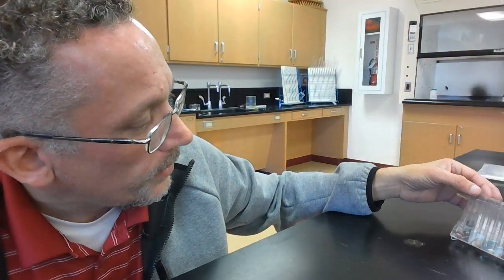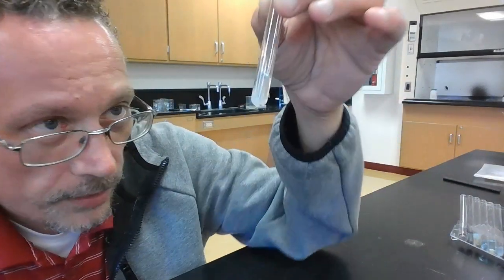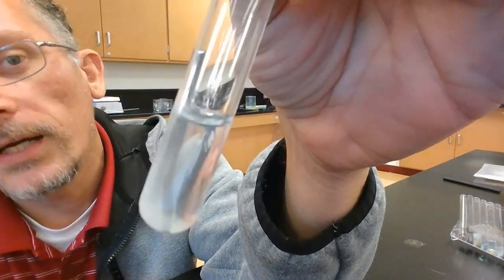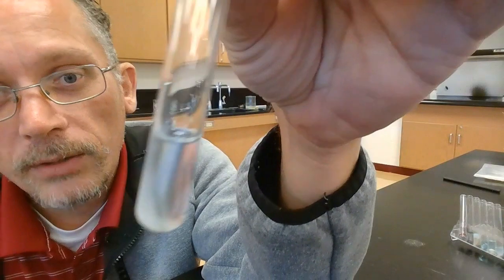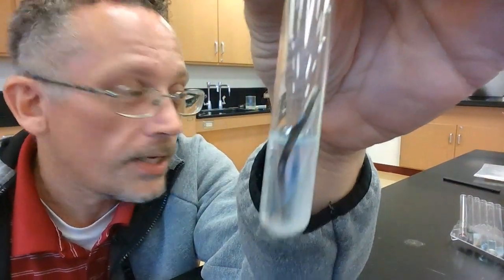And let's see, still nothing has happened with the carbon. Here we can see on the iron, it's kind of cloudy down towards the bottom. Some of the blue has gone out of the liquid, and there's a little brown buildup on the iron wire, maybe you can see, right? So there's been a reaction there.